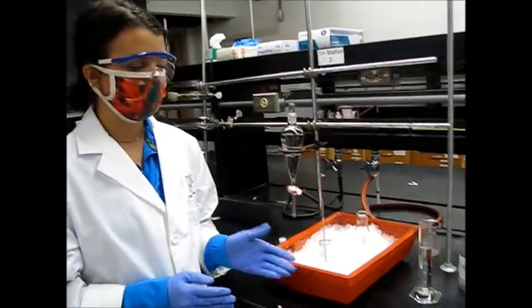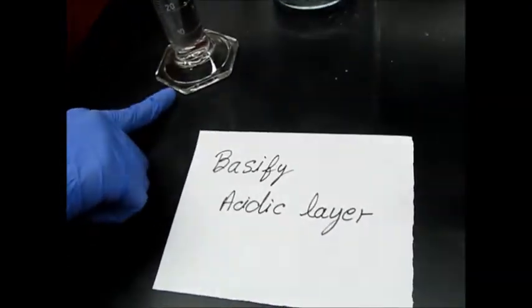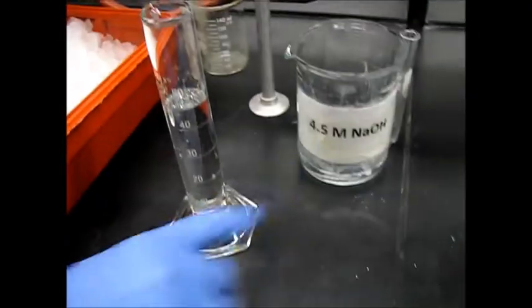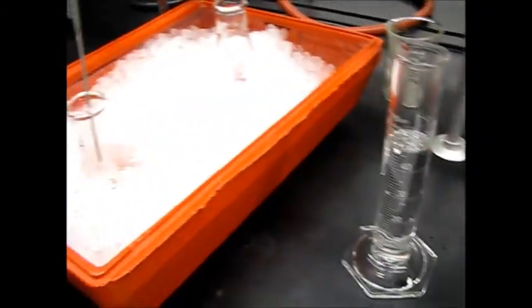We will start by basifying our acidic layer. We will take a little over 45 milliliters of NaOH 4.5 molar and add it to our acidic layer slowly.